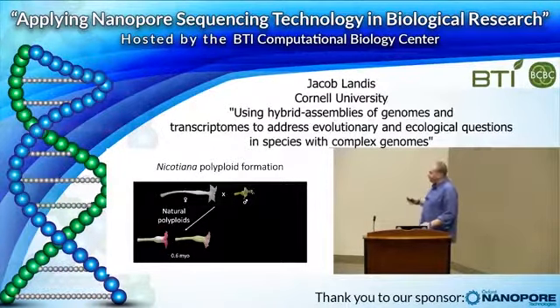And you can see, even though they had the same, or pretty much the same, genomic makeup, they do look quite different, both in terms of flower color, flower size, flower shape. And so we want to look at that and see what's going on. For these three species, there were reference genomes previously available when we started working on this project. And here are some NanoPlot examples of those.